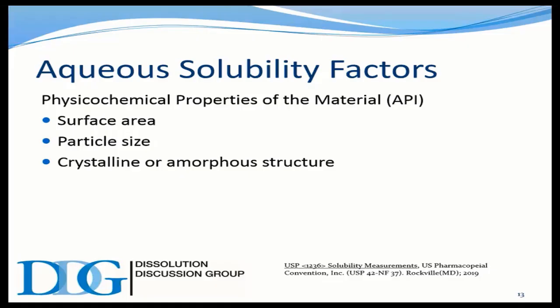I mean, there usually isn't just one narrow particle size. Usually there is a distribution, and sometimes that becomes important because you might have a particle size distribution that has a fairly high percentage of larger particle sizes than smaller, and so on and so forth.